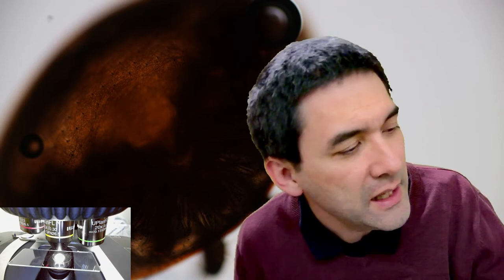It does not say that they are pre-cleaned. It also does not say that essentially they have polished edges. It doesn't say anything like that. And actually they were pretty good. Okay, so actually the packaging is kind of underrepresenting it a little bit. And then I've got another pack over there, which says pre-cleaned and ready to be used. And these were the dirty ones. It's really strange, okay?